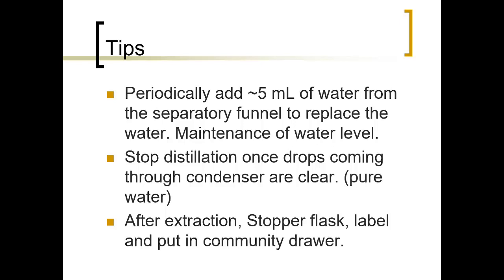Now, after you've been boiling for a while and you've gotten quite a bit of material out, maybe like 40, 50 mils of water or liquid out, you might start noticing that the distillate only comes off clear at that point. That means the majority of the clove oil has been distilled off with the water, and now it's just mostly water coming off.